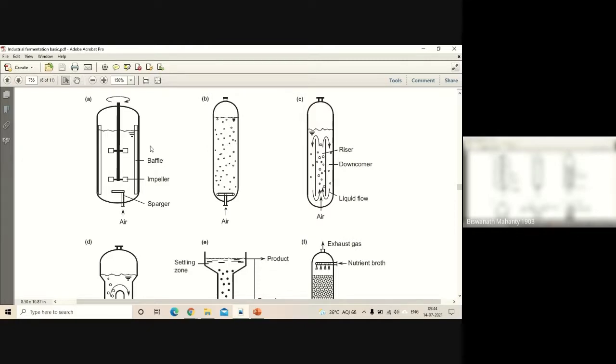The second reason: running this impeller and mixing device needs a large amount of energy, constantly rotating. You see, it is too costly. Here there is no such cost. I put the air through a compressor and slowly release it, so for 2 or 3 hours bubbles keep coming. What does it mean? I can save energy. So the first advantage is for the cell, and it also saves energy. It is good for cells that have a problem with so much shear force.